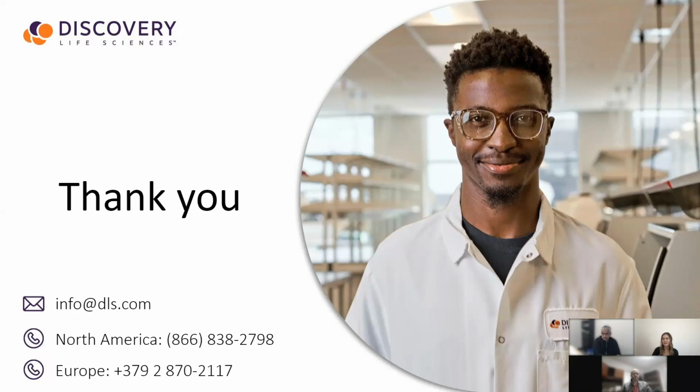Great, thank you. Next question: how is the ALU score calculated, and how can this score help compare results from enzymatic shearing and mechanical shearing in FFPE samples? ALU is a known assay in the field. There's an off-the-shelf assay from a company called Swift, which was later bought by IDT. It is a qPCR-based assay that deploys a short primer and a long primer to find out how fragmented your DNA is, and it provides a calculation with a range from 0 to 1, just like a RIN score or a DIN score.